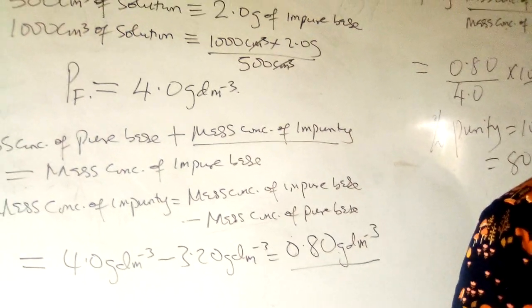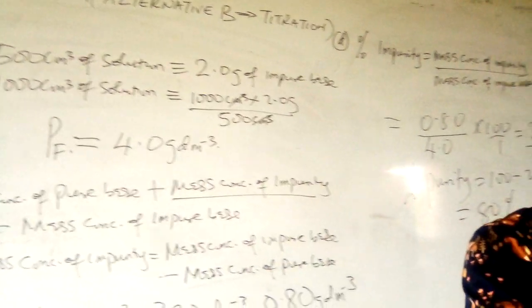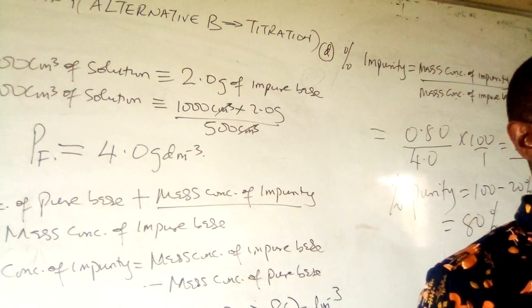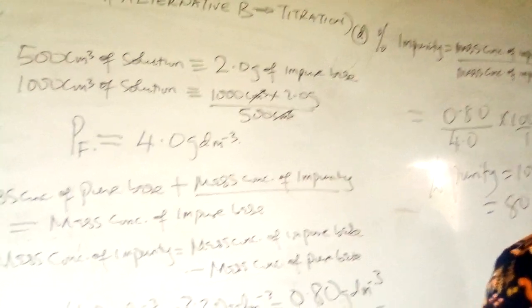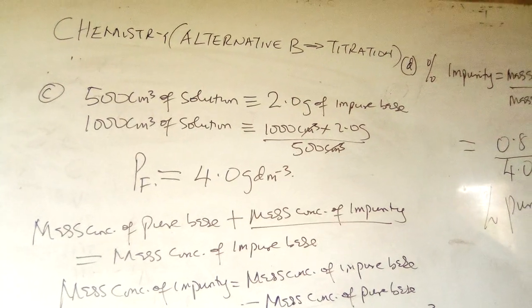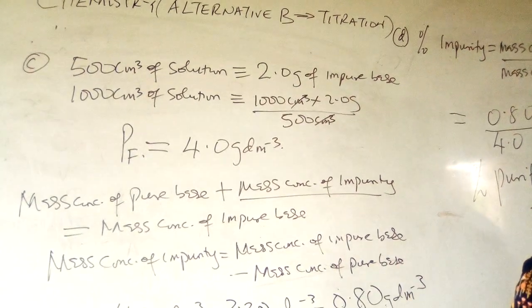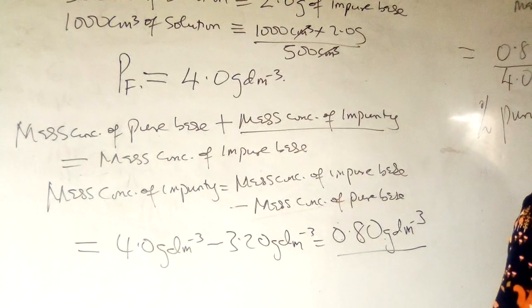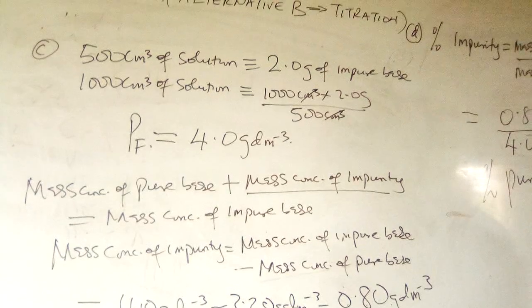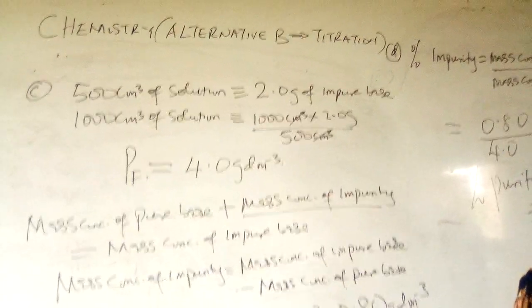If I have a liquid and I pour a substance inside it, but I don't know the mass of the substance I poured into it, that cannot be called a standard solution. Or you ask, what is a molar solution? A molar solution is a solution that contains 1 mole of a substance in 1 dm³ of water. So is a molar solution a standard solution? Yes, because we know its concentration; it is one that contains 1 mole of a substance in 1 dm³ of water.